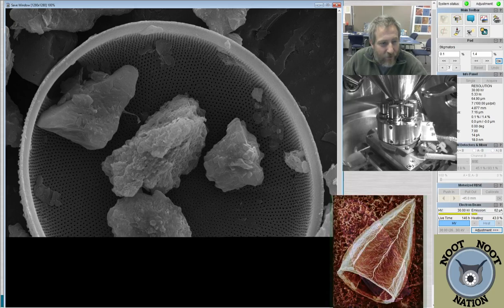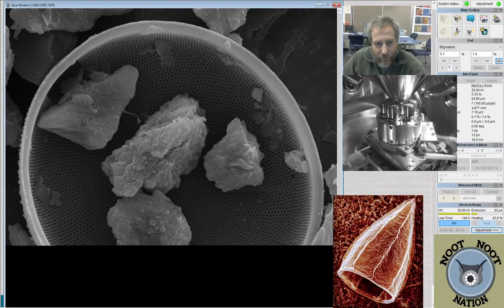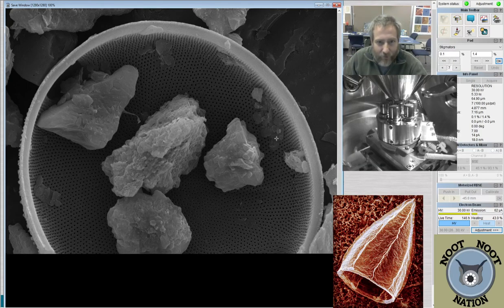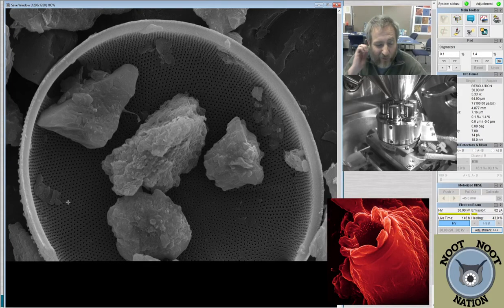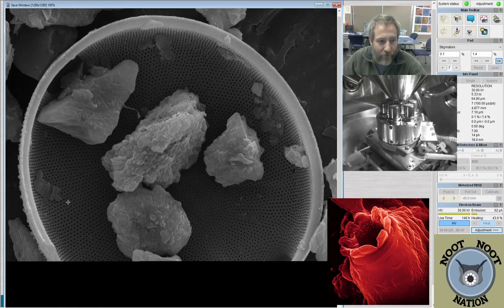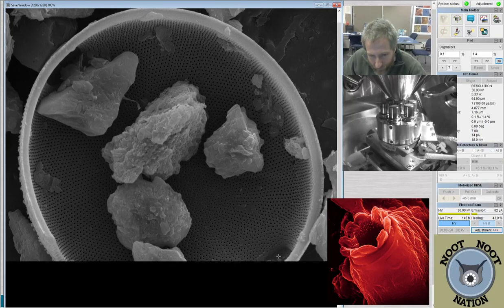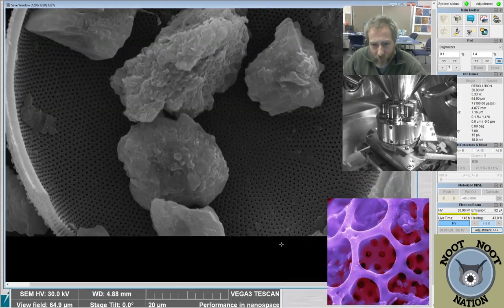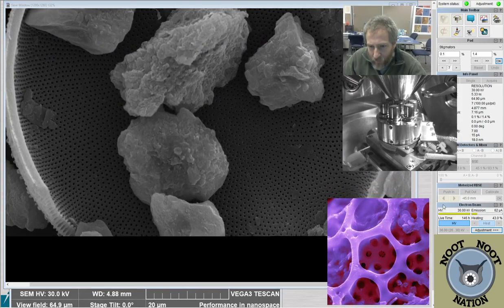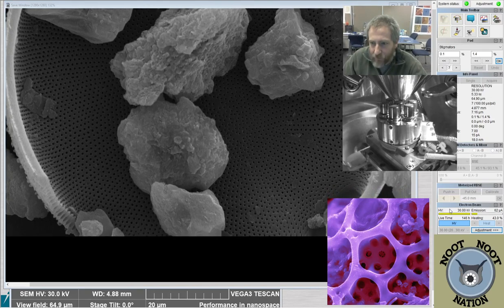So this is the internal view of a Pleurosira, and it's just got some dirt, some silt-sized dirt, and a little bit of clay-sized particles in the internal view that we're looking at. We saw this one from the outside as well. And then if you look in here really carefully, you should be able to see those little tiny holes. And I can probably zoom in on them. So you can see those little tiny holes in that pore field for the ocellus.